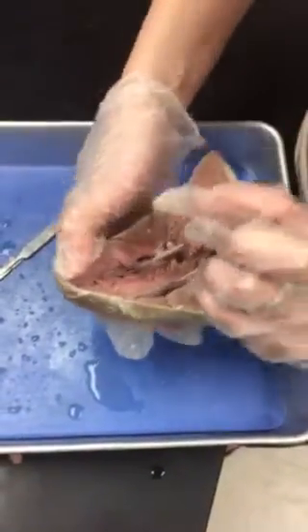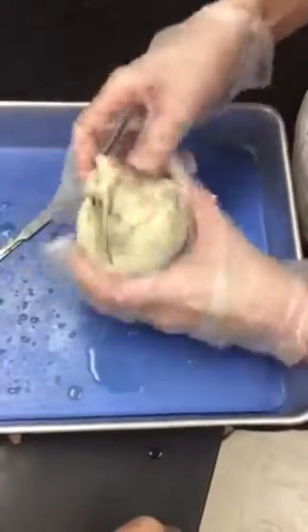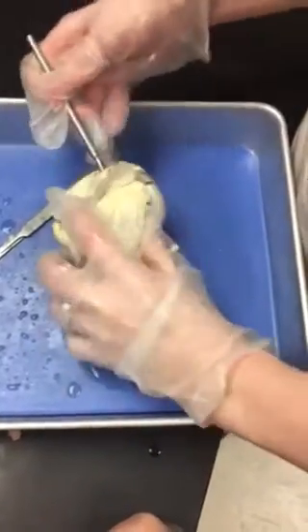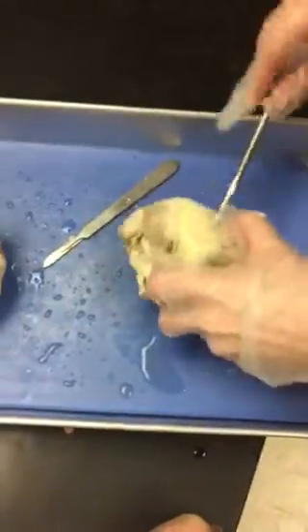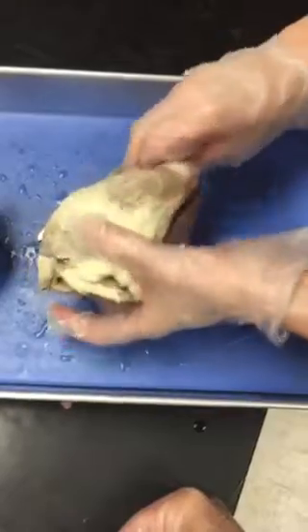43. Use a probe as a pointer and, starting with the superior vena cava, trace the flow of blood through the heart. In the space below, list the structures in order the blood would meet them during its travel through the heart. Include the valves, the lungs, and the extremity of your body on your list. Refer to your heart box from activity 411 if needed.